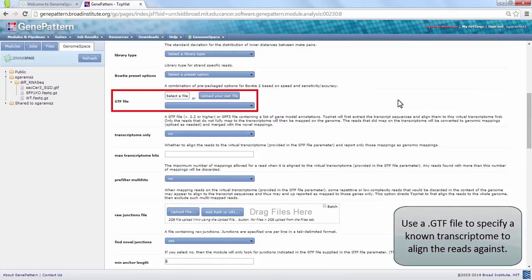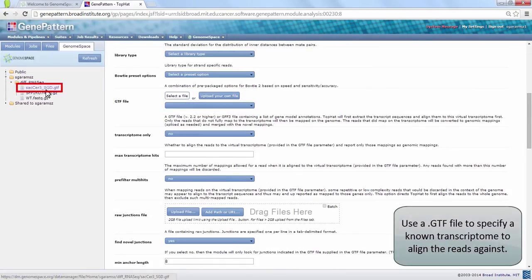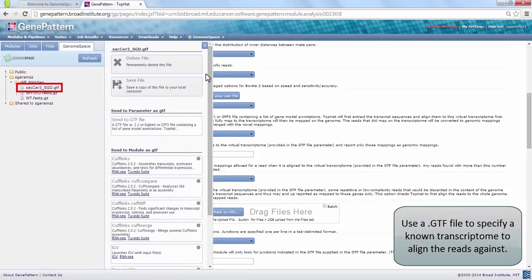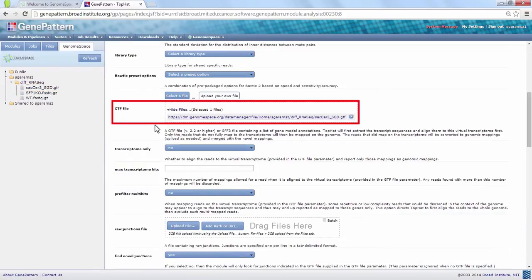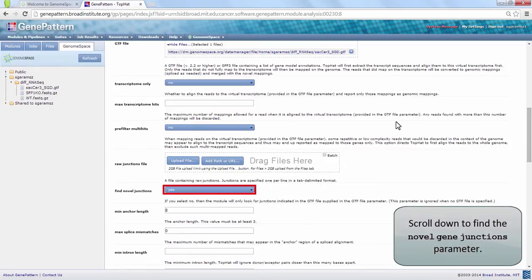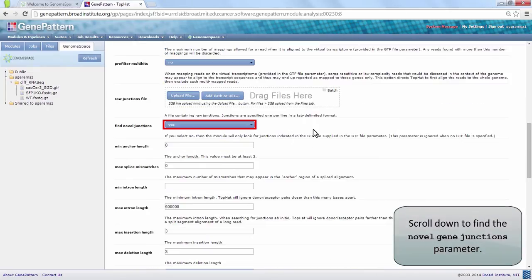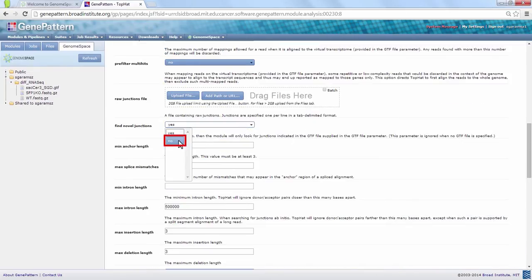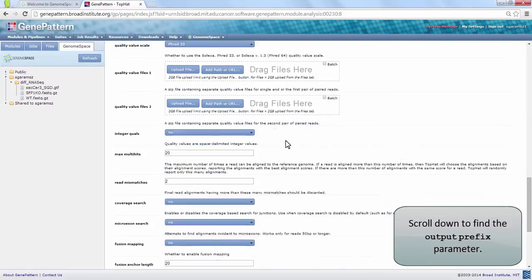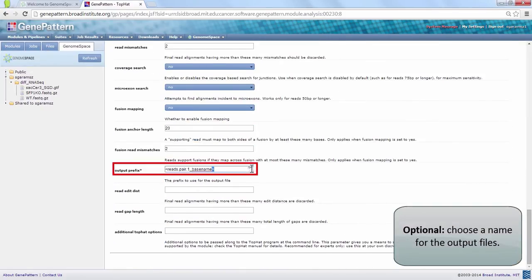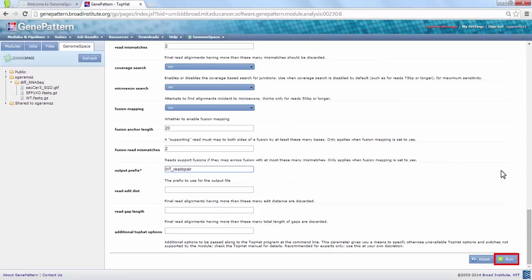then click and drag the file to the Module parameter. We will provide a GTF file by clicking on the file SACSER3SGD.gtf in our GenomeSpace sidebar. Choose Send to GTF file to load it into the TopHat module. We don't want to find novel junctions, so set this parameter to No. Finally, choose an output prefix such as WT reads pair. Click the Run button.